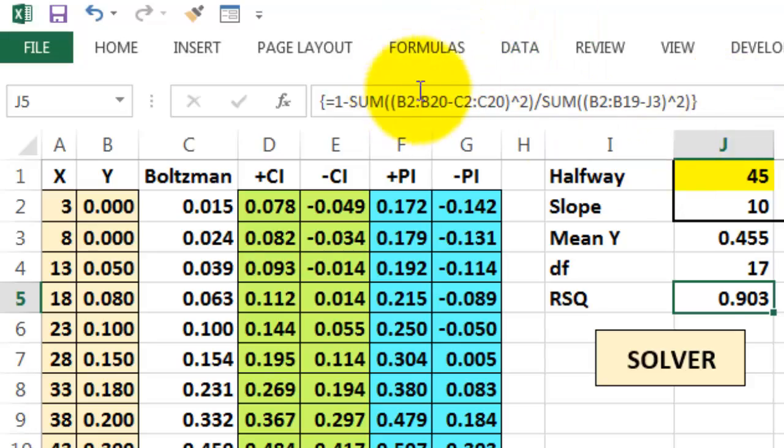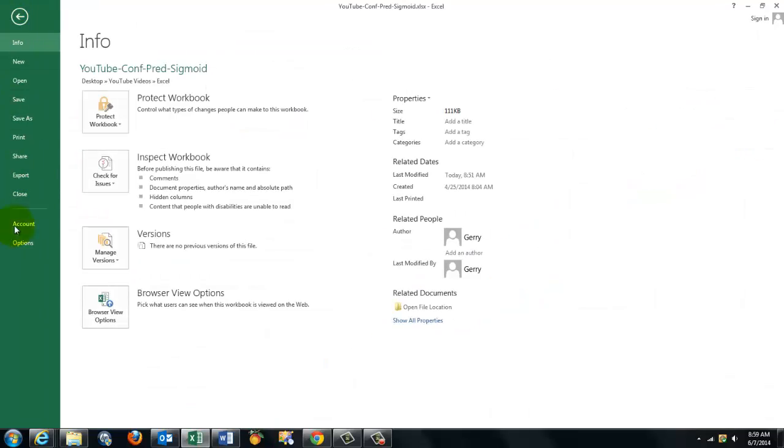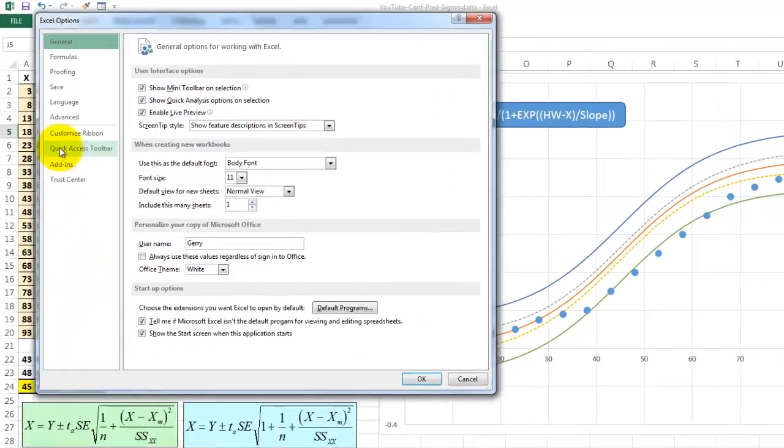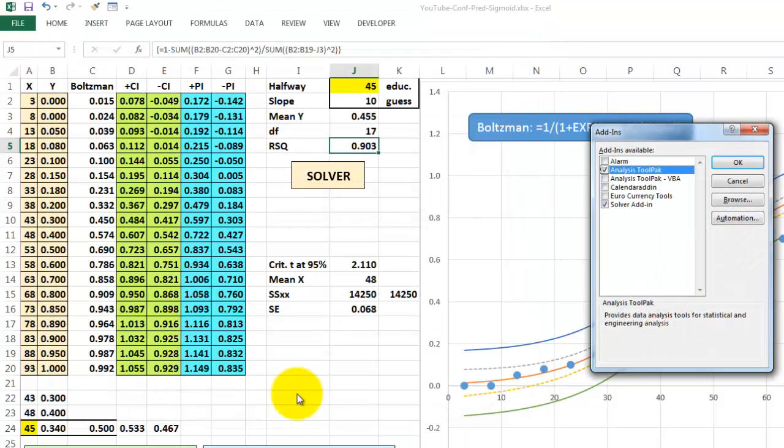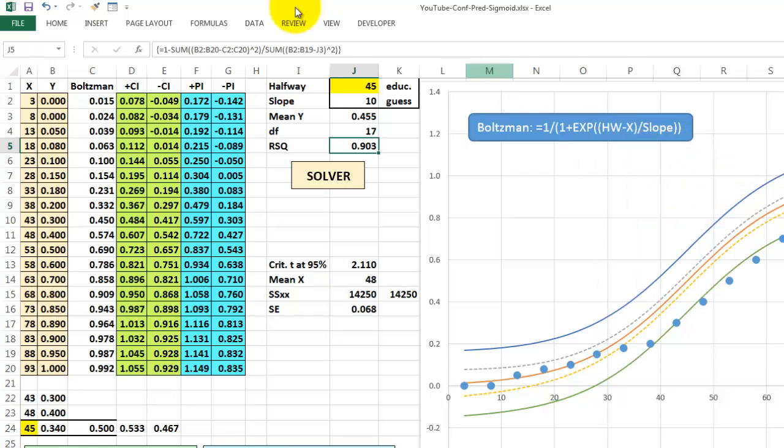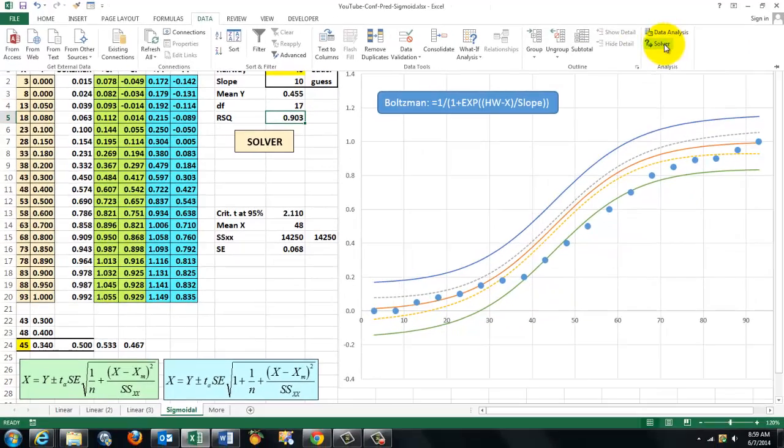Then we use solver. If you don't have solver installed yet, you go to file, options, go to add-ins, and make sure that solver add-in is activated. Once it's activated, you can just go to data and there is solver.